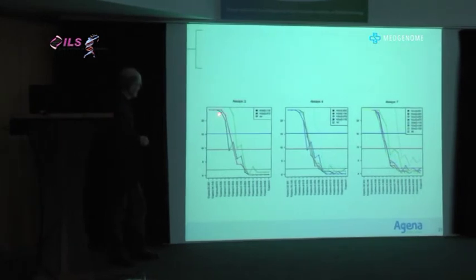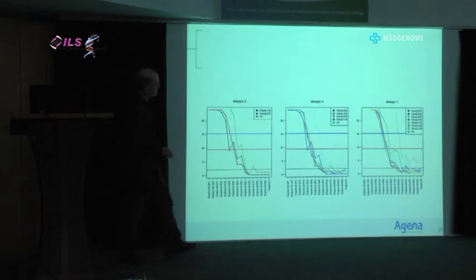On the left are single marker assays. These are factors of 2 dilutions. And this is about 1 molecule per sample, so this is down in the limit of infinite dilution. And here the red and the black are scoring single analytes, but the green is scoring 1 of 2, and you can see it's more sensitive. Here this blue is scoring 1 of 4, and you can see it's much more sensitive.